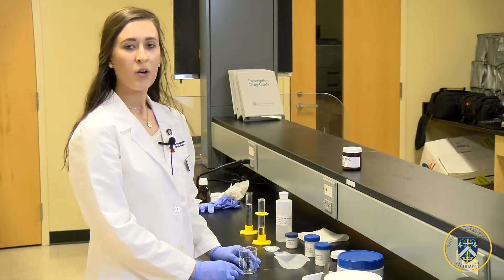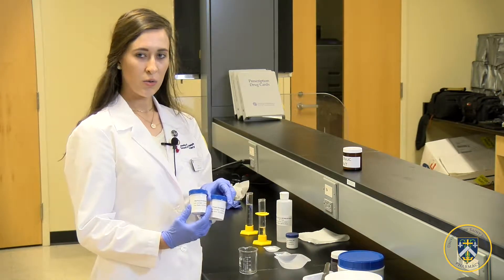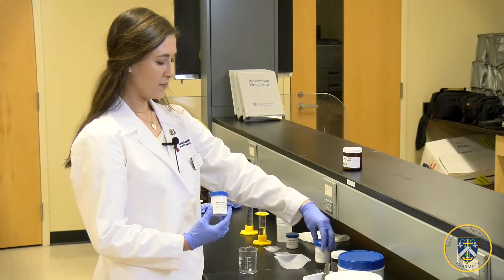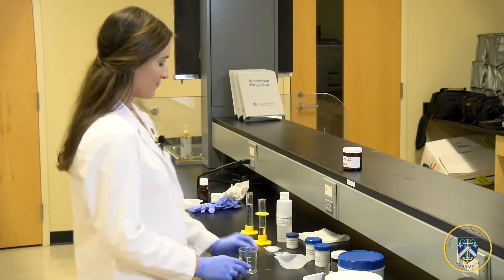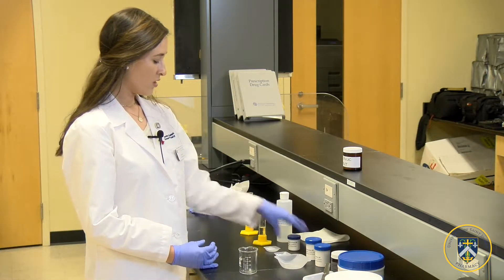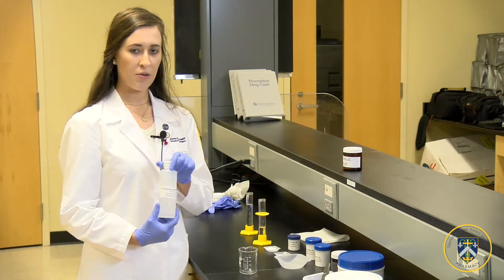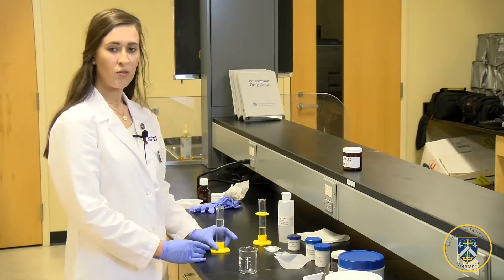Now we will be adding our parabens — methyl and propylparaben, which are our preservatives — as well as sodium lauryl sulfate, our surfactant, polyethylene glycol, which is our humectant, and water, our diluent.